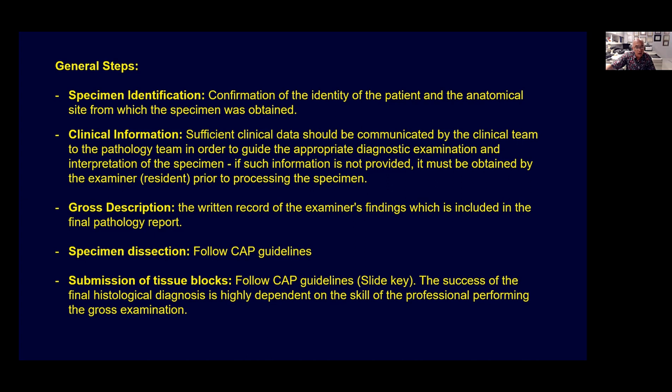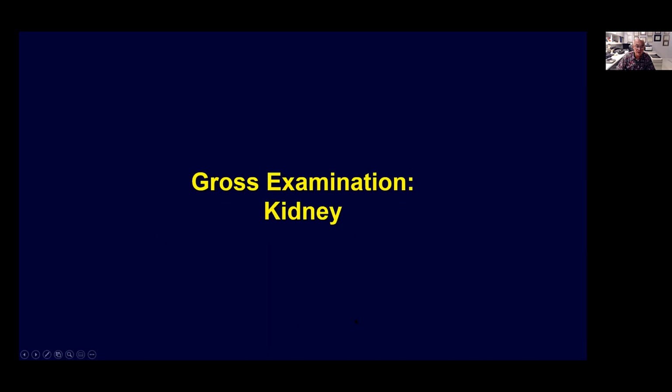Once the description is done based on the CAP guidelines, then we have to do the submission of the blocks, as you well know, and with a very clear identification of the slide key. So we're going to start with the gross examination of the kidneys.